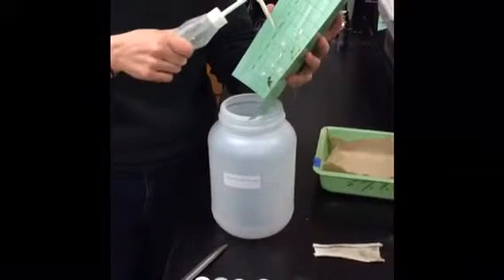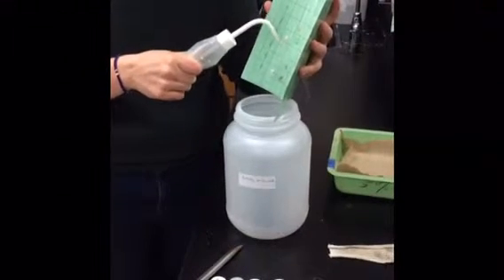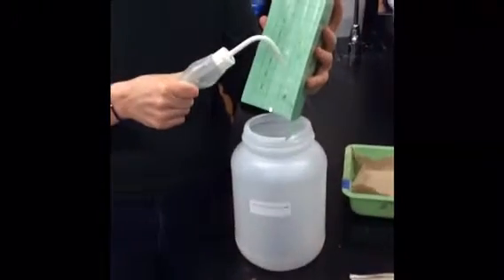Once your grid is cleaned off, you want to rinse it, do a final wipe in the sink, and then leave it to dry. Make sure that it's dry before you clean up your station.